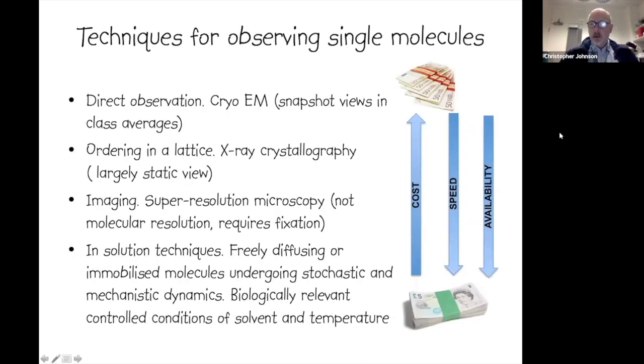So here I'm being slightly controversial in suggesting that actually there are a lot of techniques around that you might not have thought about for observing single molecules. Well, obviously there is cryo-EM, which is a direct observation method, and you are in fact observing single particles. This is giving you a snapshot of the structure of the particle. You could also consider X-ray or the growth of crystals to be a single molecule, but ordered in a specific orientation in a lattice. There are obviously very many molecules, but they're all aligned in exactly the same way. Then we have techniques that have been described in the fourth talk in the series, classed under super-resolution microscopy. Technically, these are not molecular resolution, and also they require fixation.